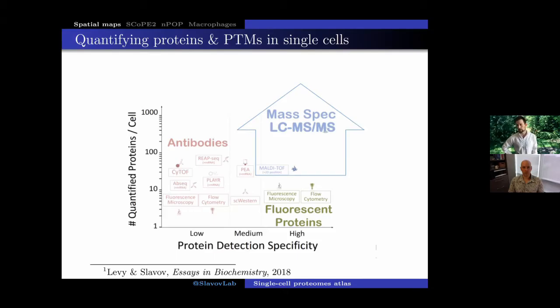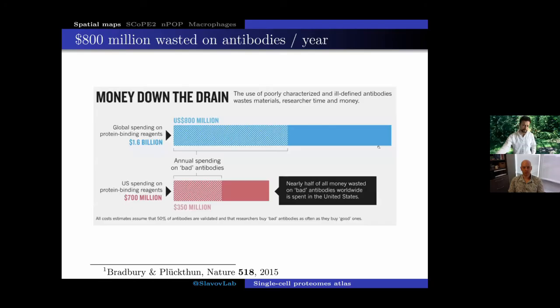So we were interested, when we started working on this problem a few years ago, to push the sensitivity of mass spectrometry methods to be able to analyze single cells, together with other colleagues in the field, as Ryan Kelly beautifully illustrated their own path in pursuing this goal. So in deciding what path to take, for us, one observation that was instructive was the difficulty of coming up with a large number of standardized affinity reagents.